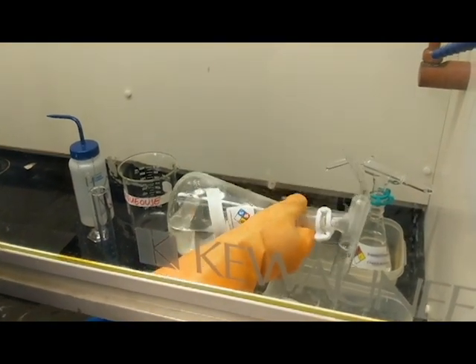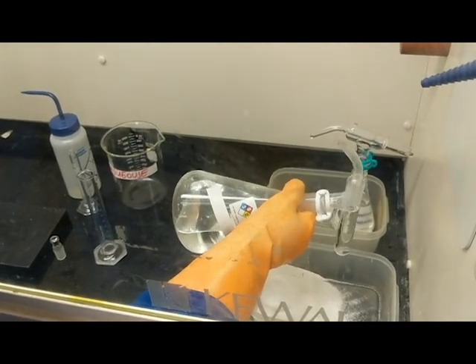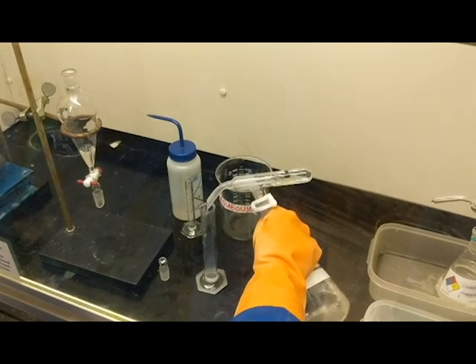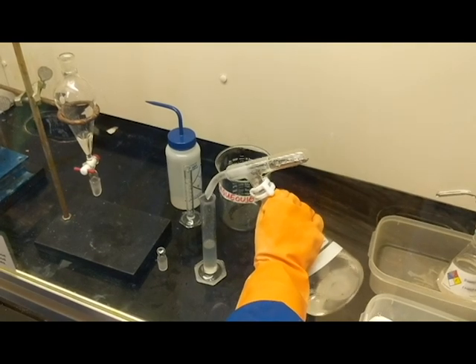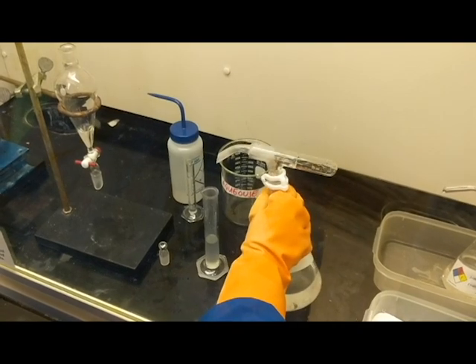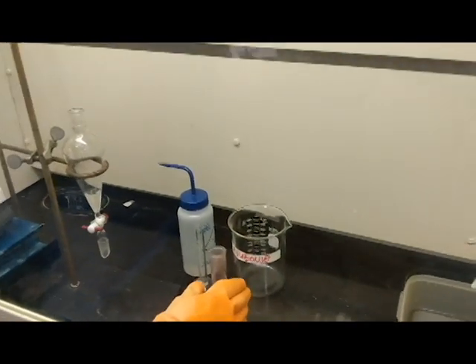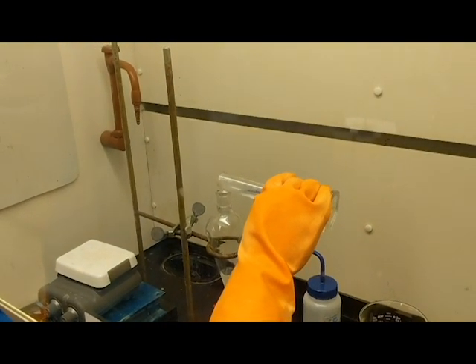I'm going to hold my repipetter with my dominant hand. I'm going to invert it just like I did before, allowing the container to fill on the inside chamber. Once that's full, I'm going to swing that around, aim it right over the graduated cylinder, and carefully decant my pre-measured 25 mLs. This class is not quantitative, so you don't have to get every last drop out. It's just an estimate. I'll return the decanter back to the secondary container, and slowly I will add my acid to my extraction funnel.